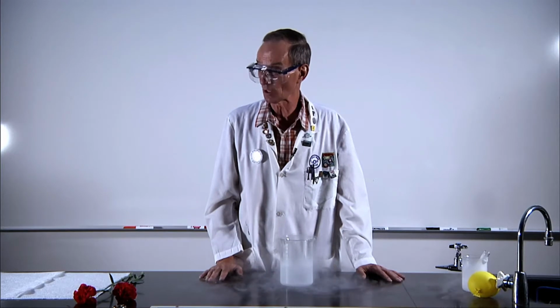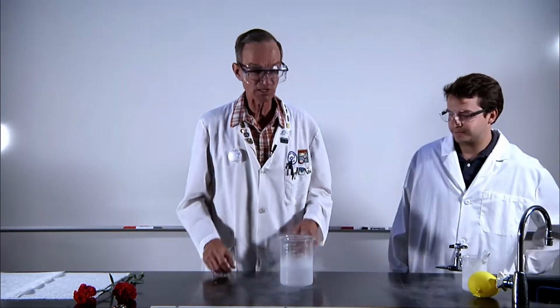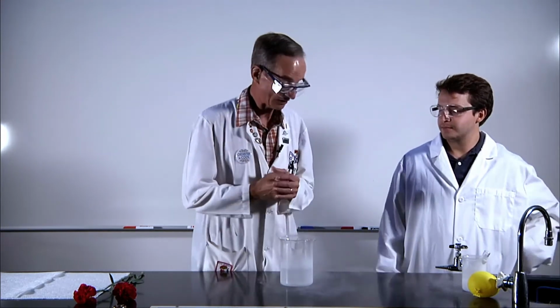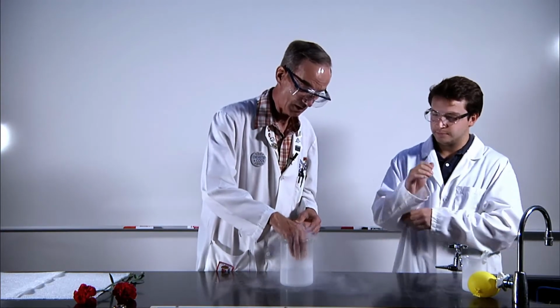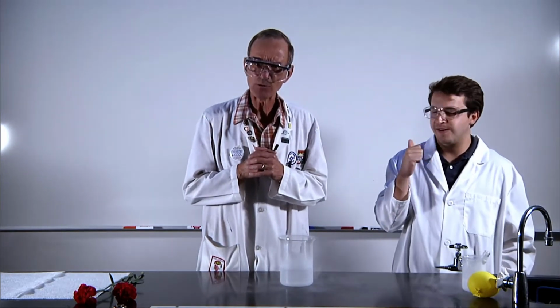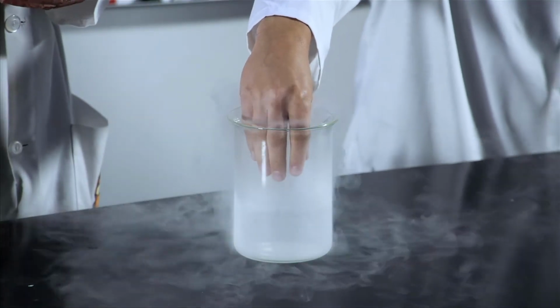I'm going to have a demonstrator, Jack, come up here, and together we're going to demonstrate a few things with you. Now, one of the things that I think is a little troublesome to people is that when they see this boiling, they think that it must be hot. Now, I'm going to demonstrate this for you, Jack, and then I'm going to have you do it. I want you to put your hand in there, but just don't touch the liquid. This is actually safe to do. Even if Jack does happen to touch the liquid, he will not do that very long. It's pretty cold. So he's just going to put it above there and describe to us what it feels like. Very, very cold.